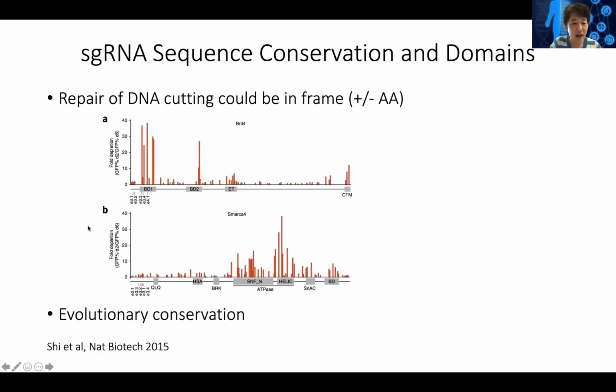There's another study, where in order to target a particular gene, these are not introns and exons. These are all exon sequences, but there are sequence domains, because on the proteins there are certain functional domains, but there are also spacers to connect them together. And so this is Chris Vakoc's group. They designed guides across this whole gene, because you can design hundreds of different guides around here, and they want to see which guides really give them the correct phenotype.